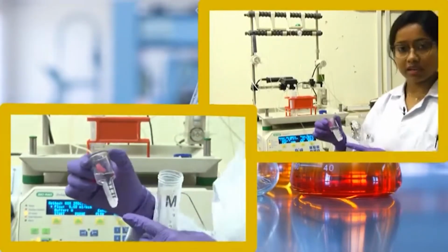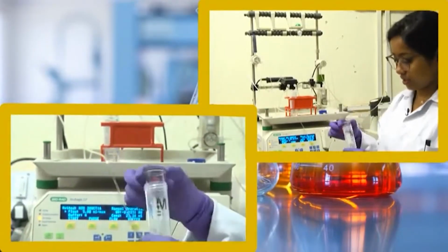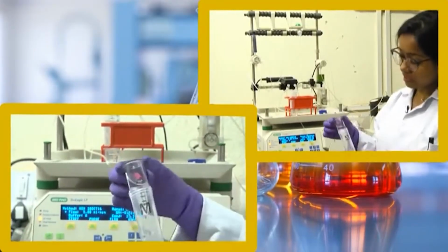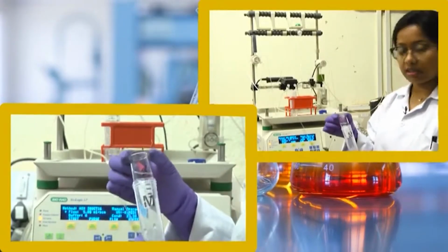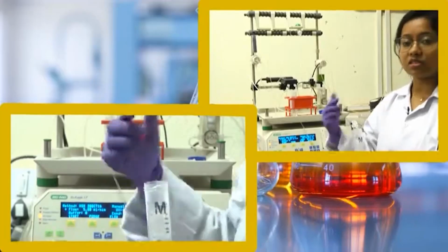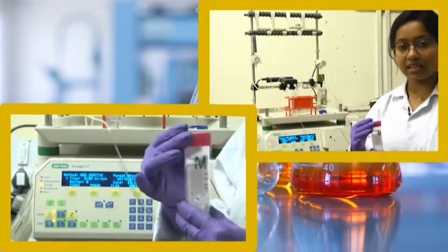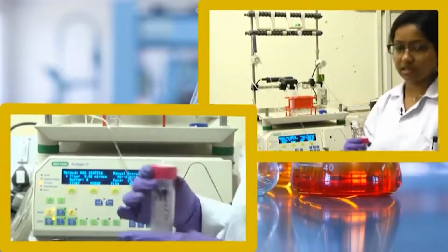You should use 3 kilodalton because there might be a chance that your protein also comes out from this holder. So by using this kind of instrument and a centrifuge machine, we can concentrate our samples and then check the purity and the quantity of that particular solution.